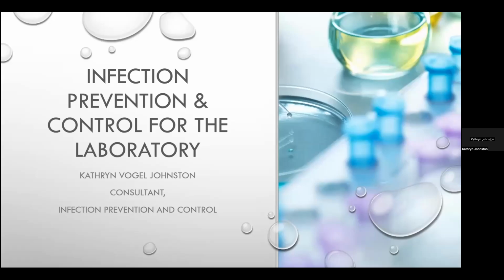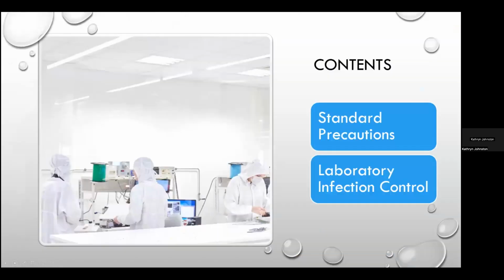Today's topic is infection prevention and control for the laboratory. I'm going to speak about IPC practices in general, and then we're going to talk about IPC more specific for the laboratory. So we're going to start with standard precautions, and then we're going to talk about laboratory infection control practices.